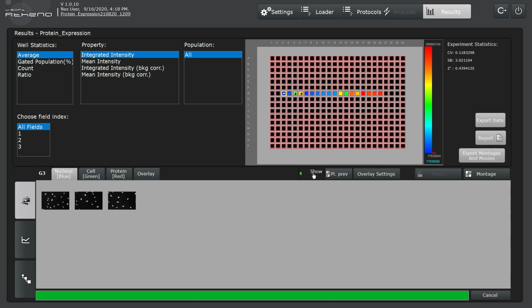To begin, I will turn off visualization of the segmentation masks. Next to this button, there is a plate preview button, which can allow us to look at multiple images across all wells in the plate simultaneously. This visualization tool can be utilized to qualitatively and visually compare a treatment effect across several wells in the multi-well plate. But to enable such a comparison, we must first set constant contrast settings for all images, which is a process I will describe later in the video.